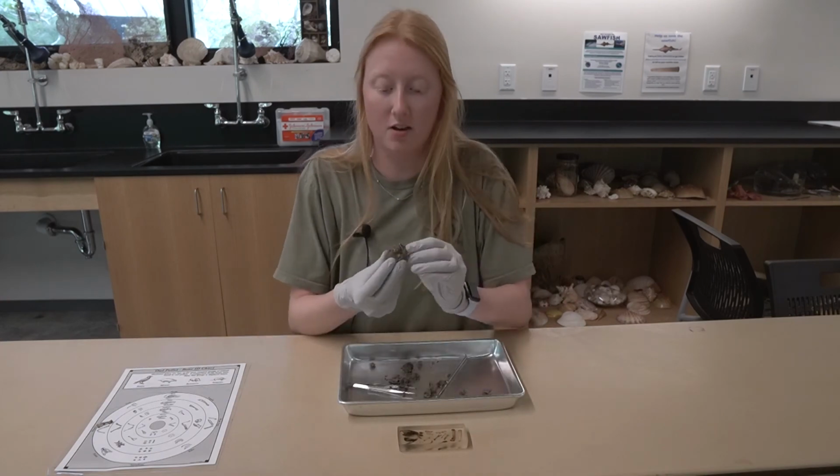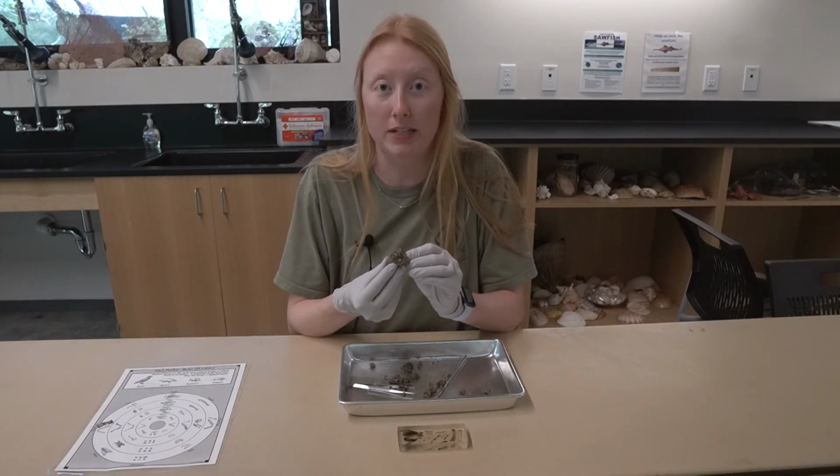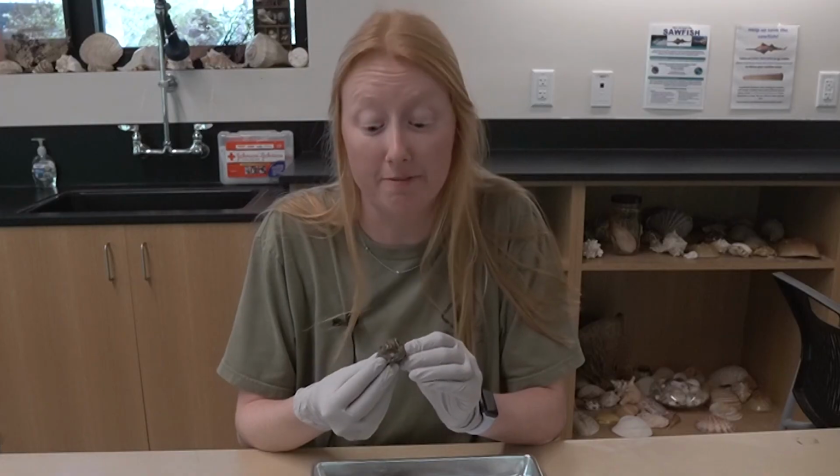So you can see in the orange right here that those are gonna be two really, really big pairs of front teeth belonging to a pretty big rodent. So you never know what you're gonna get in these pellets. Since it came from one individual owl, this owl had a very good meal.